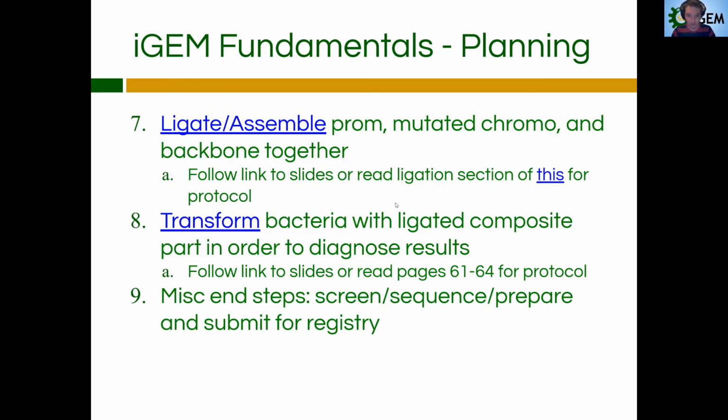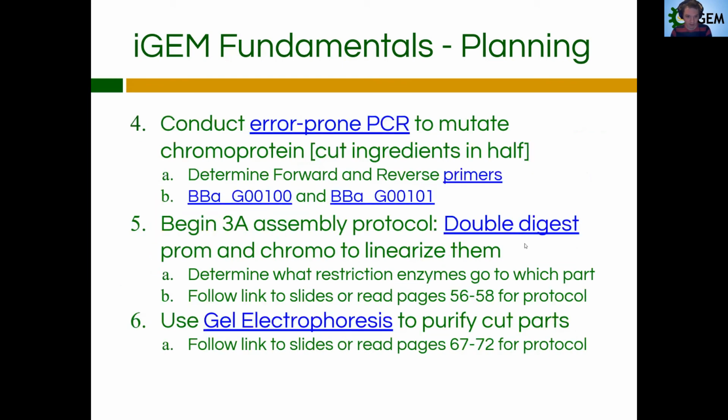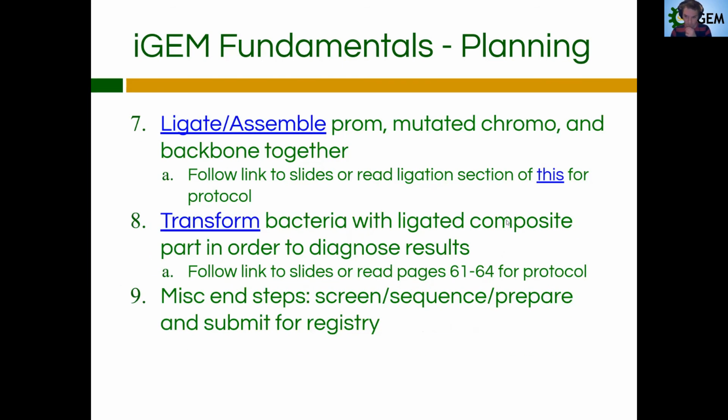After you make your composite part through this 3A assembly protocol, you're finally going to transform bacteria again. So notice you've made kind of a loop. You started with transformations, and you're ending with transformations. But instead of transforming the parts individually this time, you now have all the parts connected. They're all one part. They're a composite part.